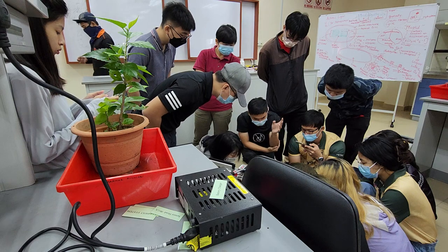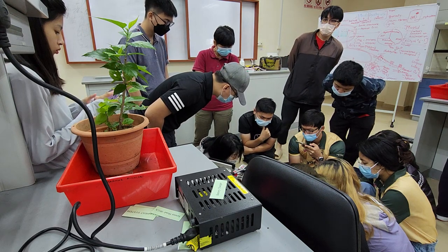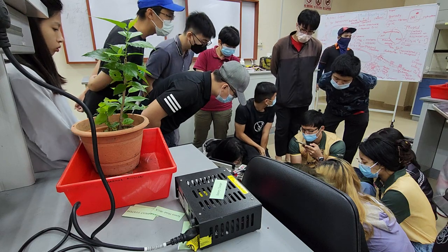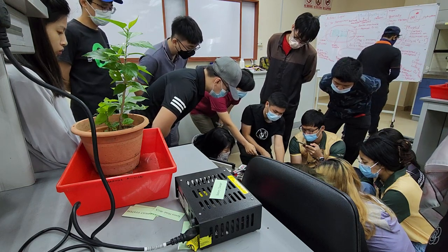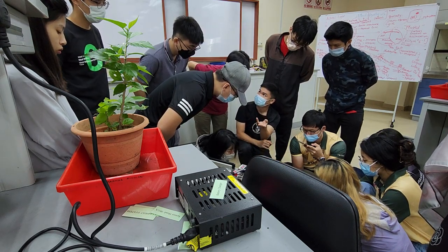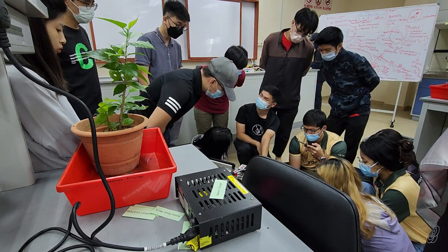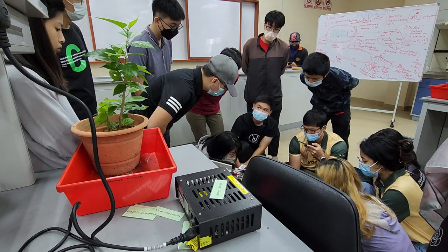Because we are in an air conditioner area, the air inside this room is kind of low, dry. 55 minimum. This is the controlling knob. So you bypass to increase the RH, the scrub to reduce. So the sensor will retain this, and also that mesh, because that is the sensor that will sense and then pass back to the console the relative humidity.